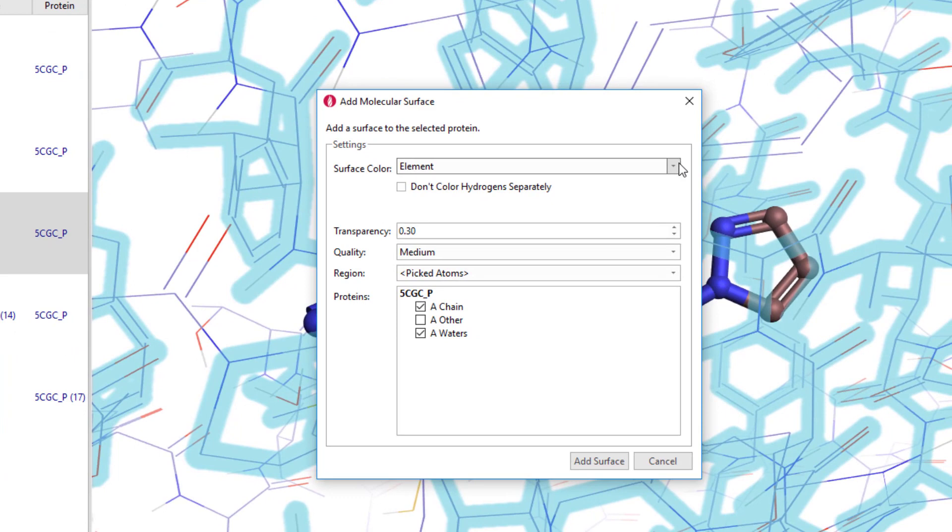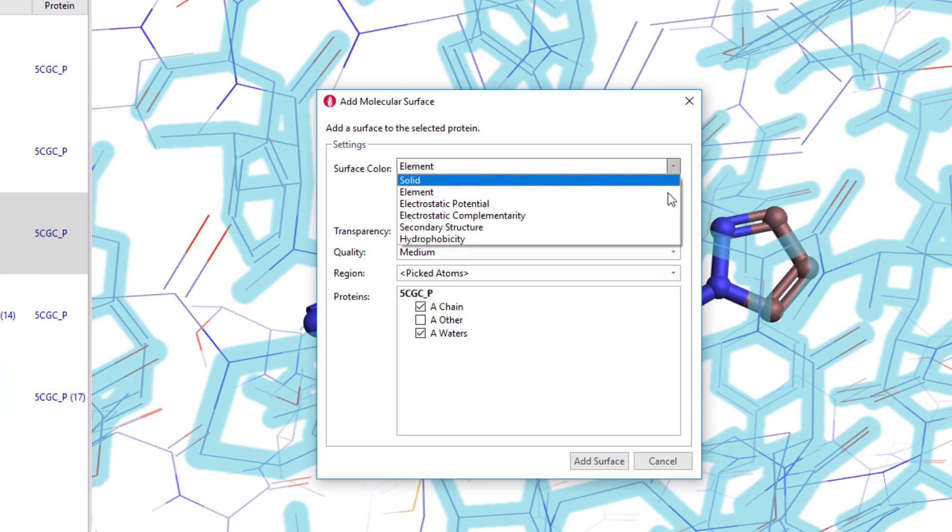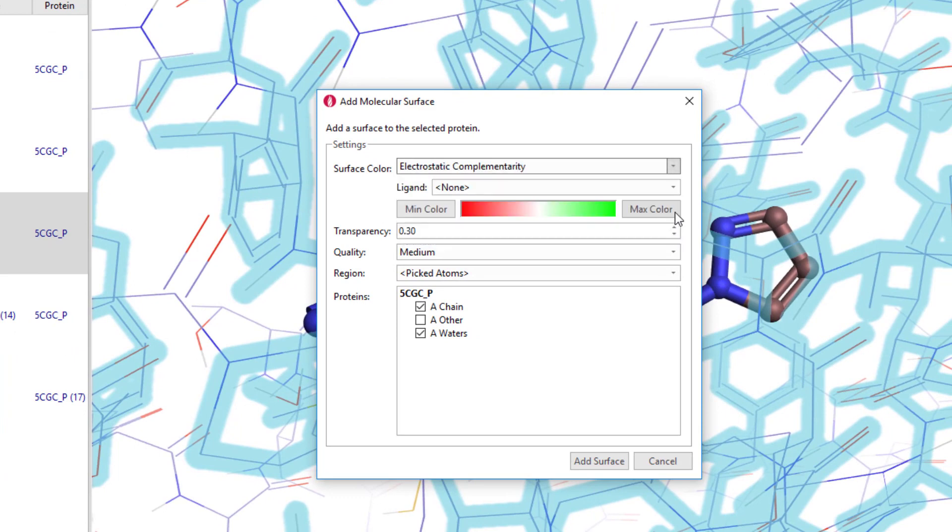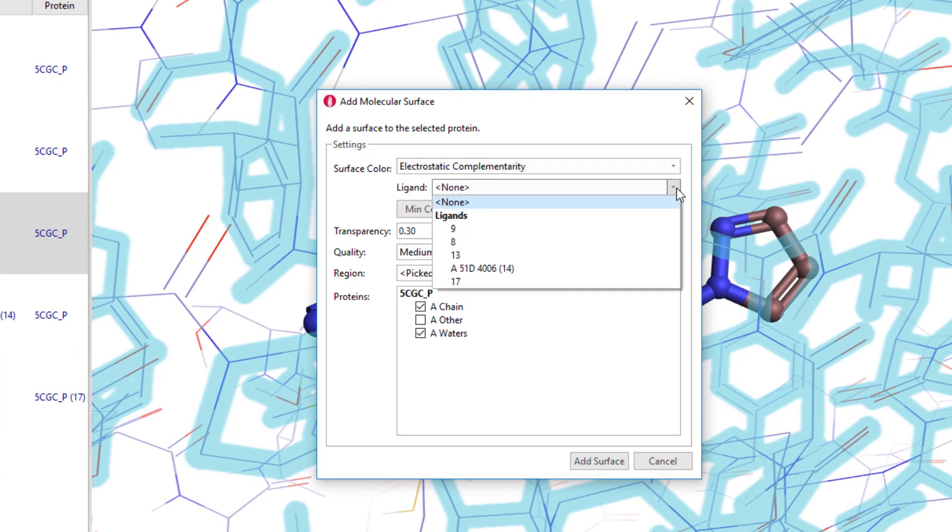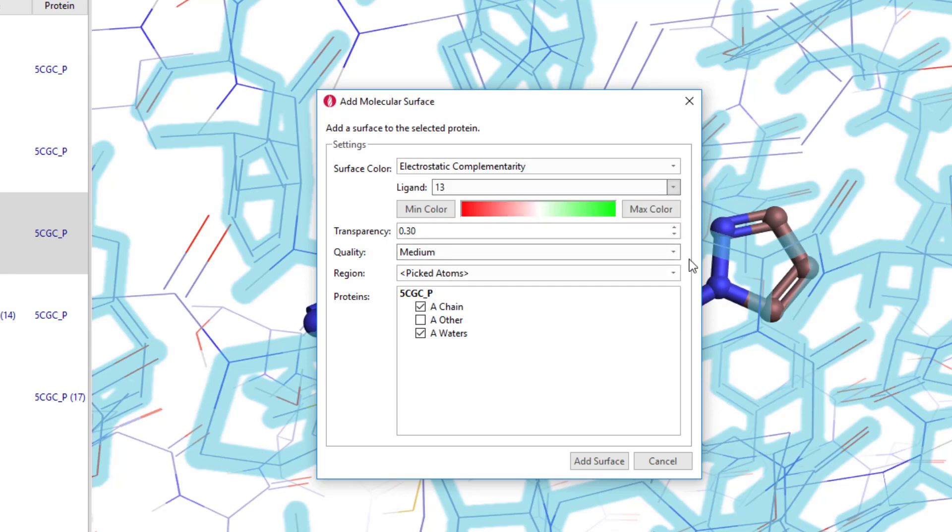I need to select electrostatic complementarity as the surface colour, then select the ligand to be included in the EC calculation. Other settings such as the colour, transparency, and quality of the surface can be changed.